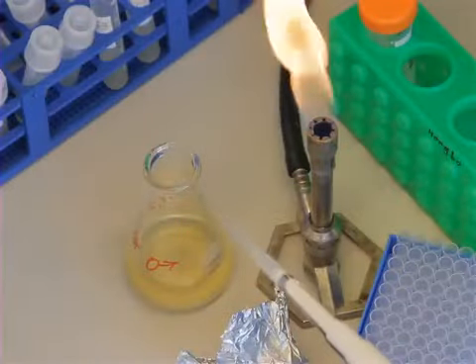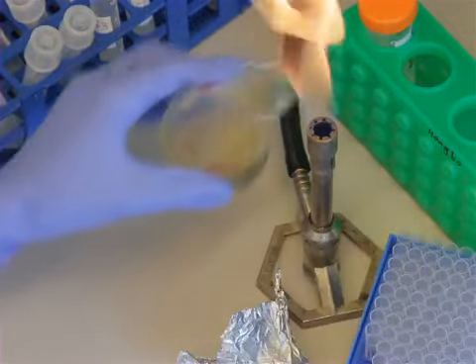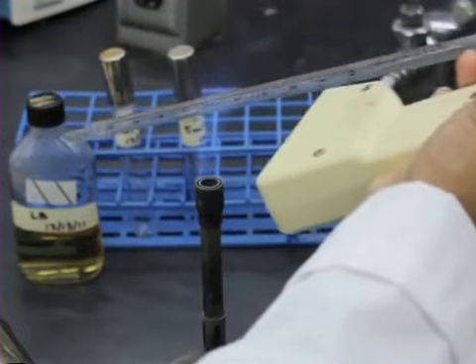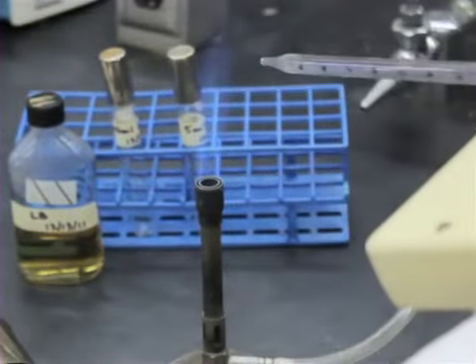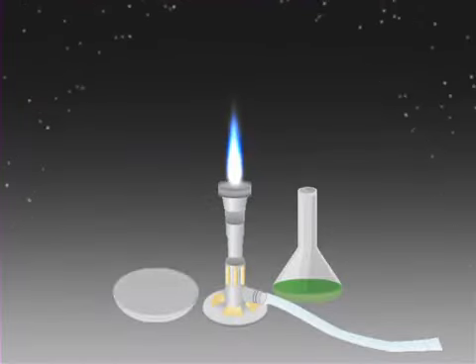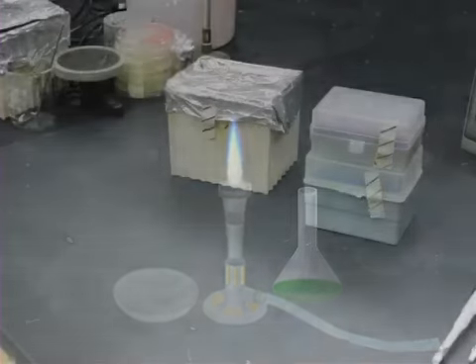When working with bacteria, one should always use aseptic technique to maintain sterility. Aseptic technique typically involves the use of a Bunsen burner to sterilize instruments and reagents and create a convection current, which keeps airborne contaminants out of the workspace.